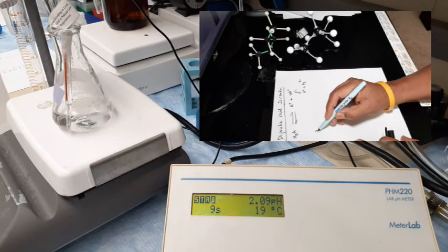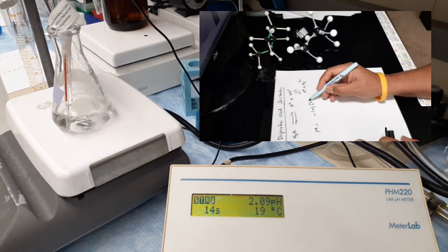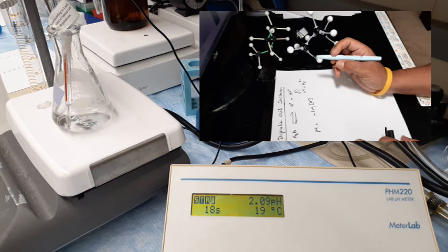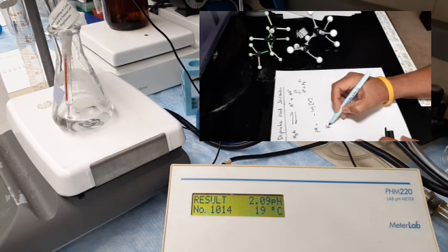Now slowly the pH is going up to 2.09. We have added about 10 ml of sodium hydroxide. At this point the pH is 2.09.